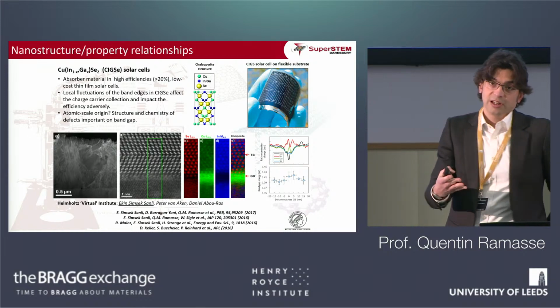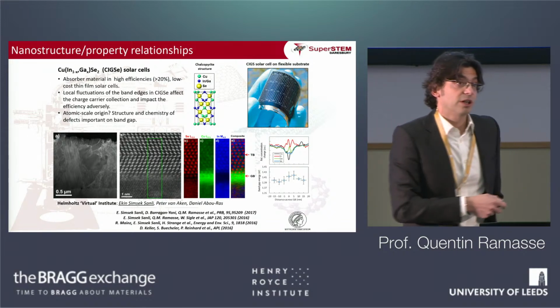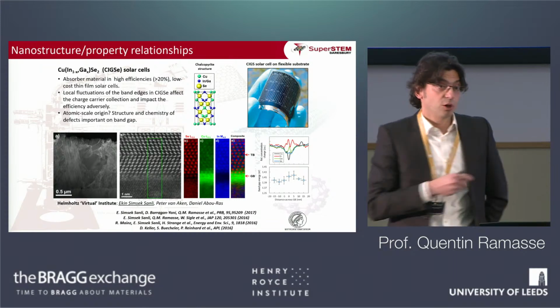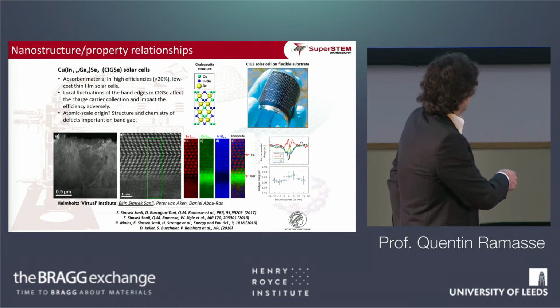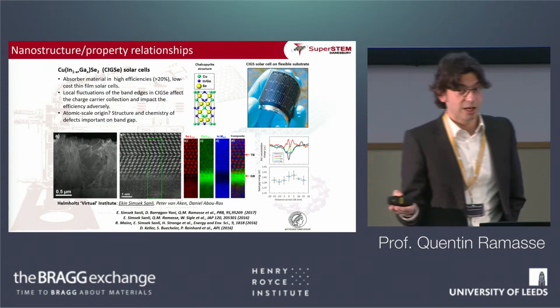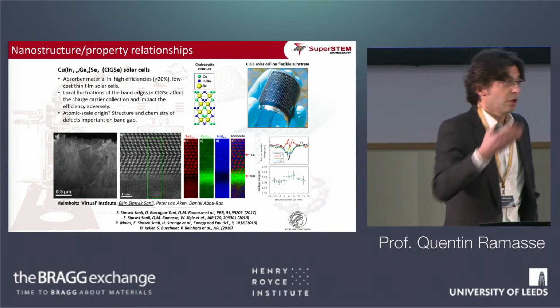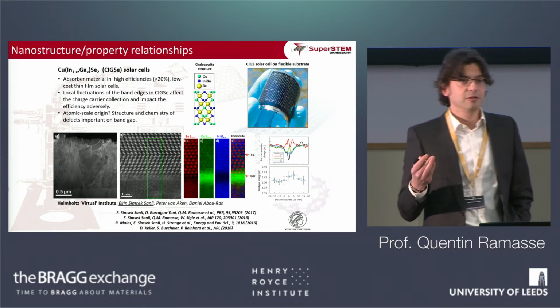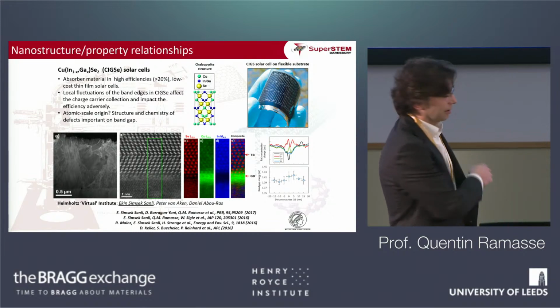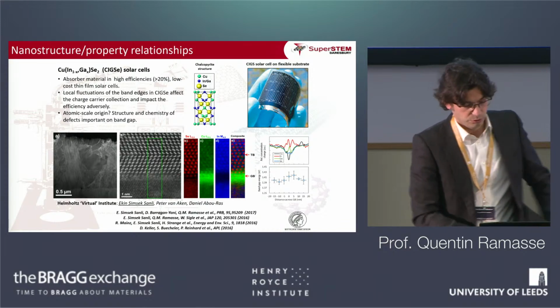And with that information, you can then go back to what the actual property of this particular boundary is by looking at the band gap change across a boundary that has more or less copper within it, and see those changes from about 1.39 electron volt to 1.41 electron volt. So changes in band gap of the order of 10 or so milli-electron volts correlated directly to single atomic column information that you're able to draw from a device that is functional all the way down to those columns.